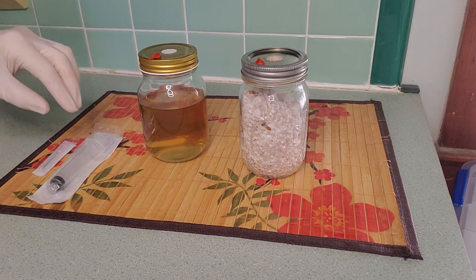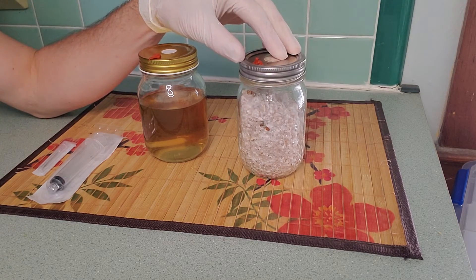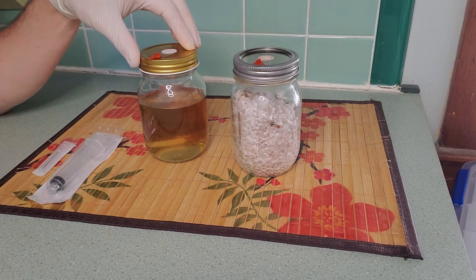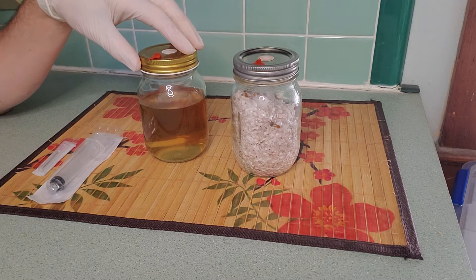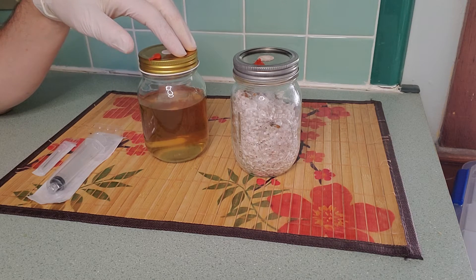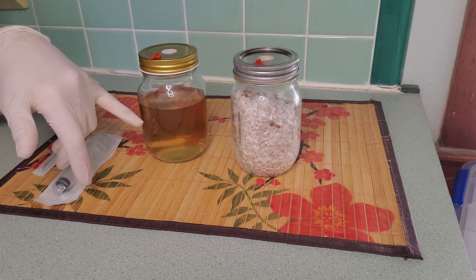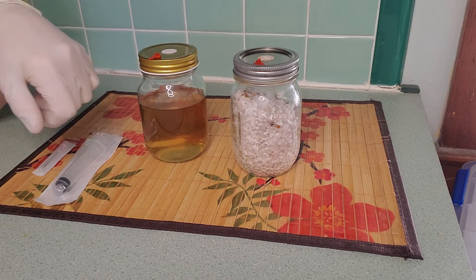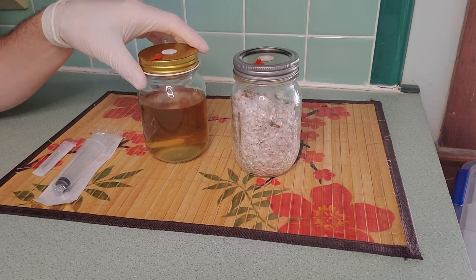All we need is a syringe needle, a grain jar that's fully colonized — you can see fully colonized here — and a liquid medium. In this case I have a jar of liquid, it's just water and malt extract. I sanitized it in a pressure cooker for 30 minutes. You can see it's a little bit discolored here — that's from the malt extract; some of the sugars caramelize a little bit in the pressure cooker and turn it just a little bit off color.